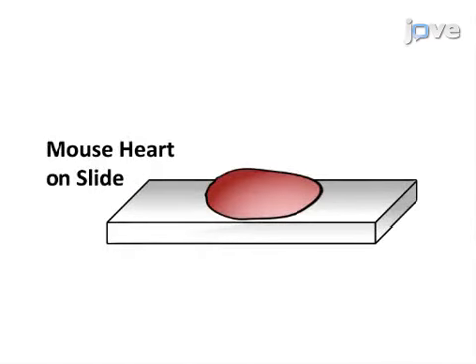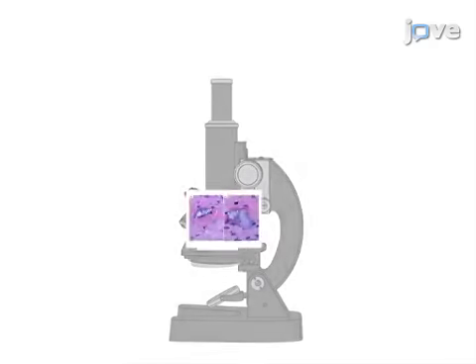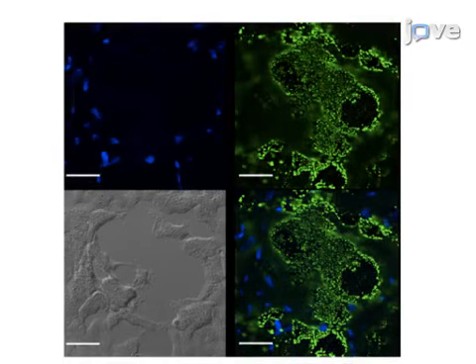Then the hearts are either paraffin embedded and stained conventionally or fixed into OCT compound for immunofluorescent staining. Evaluation of the stained sections can show cardiac microlesions randomly distributed across the myocardium, collagen depositions in convalescent mice heart sections, and pneumococcal capsules within the cardiac microlesion.